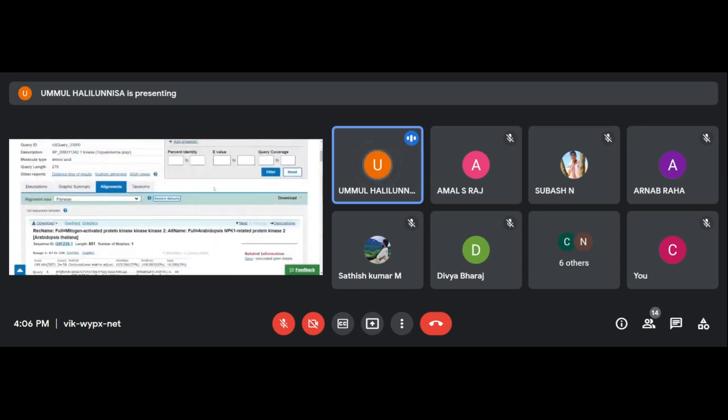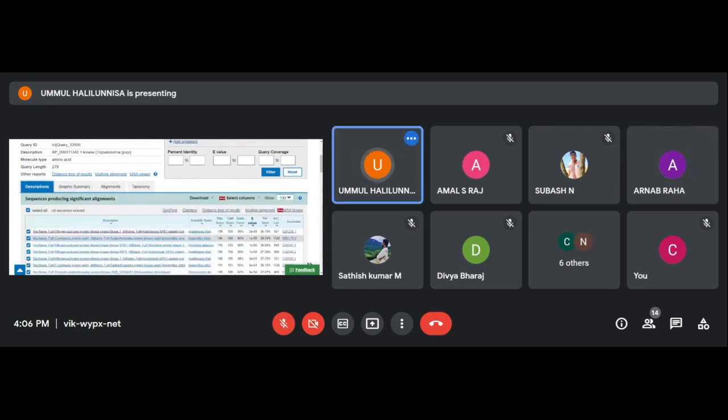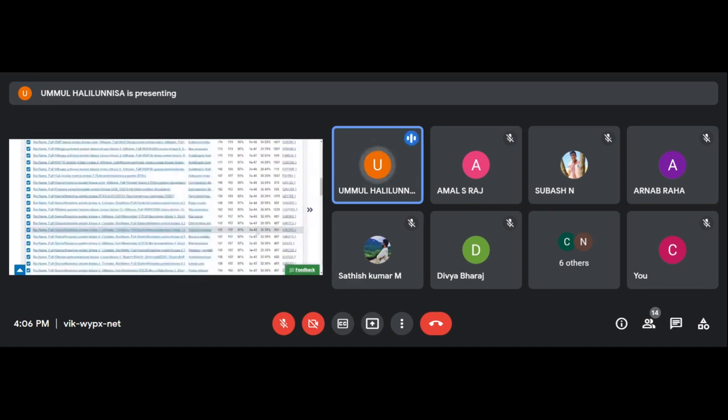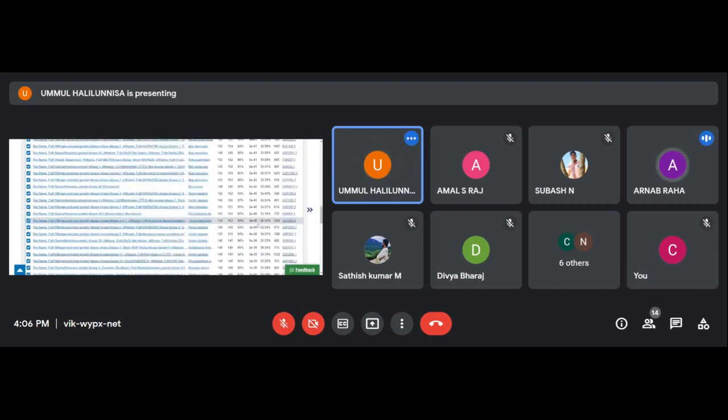Here, if you see, these are 36%, which means it's homologous, and query coverage we are having 98%. That is also fine. Below that 27, if we are having that much variation, we will say that is a less homologous sequence. Okay, ma'am. Got it.